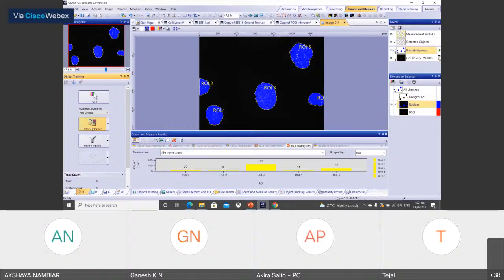So first it needs to identify the objects, and then, if necessary, you filter the objects, and then you choose which tracking algorithm you would like to use. I mean, is it moving fast, or is it dividing, or such kind of thing?